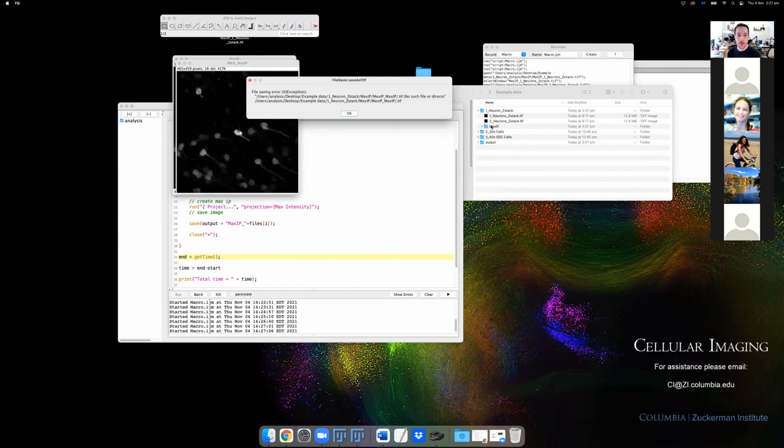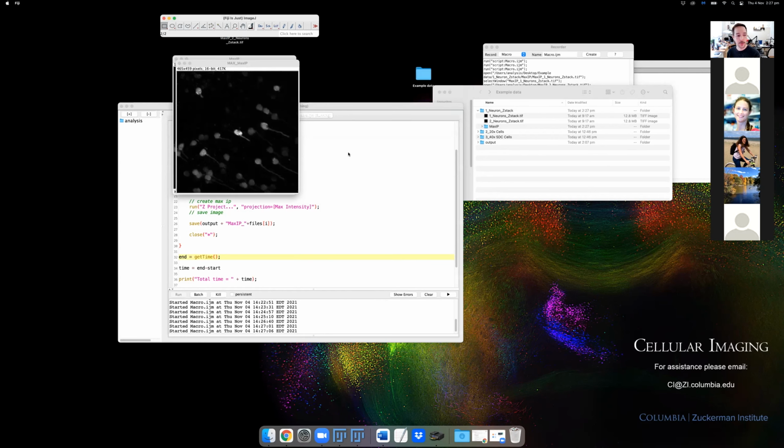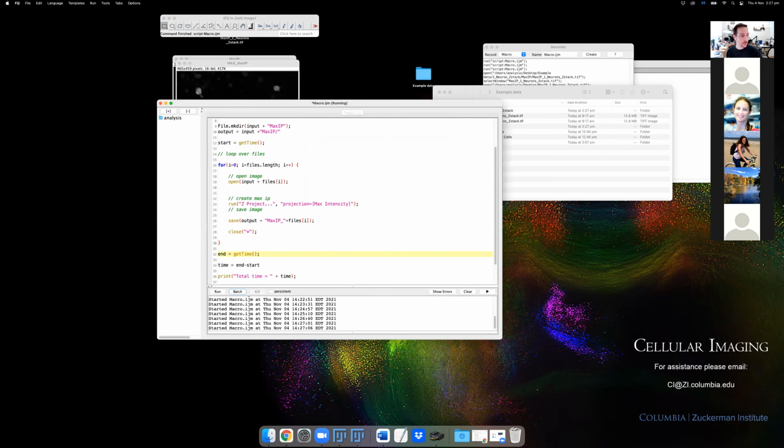And so a really useful thing that we can do is just process only images. And this way, if you've got text files or folders or other things inside the folder and you don't want to process those, we can ignore those. And probably the best way that I can help you with this is I'll just share a function with you that deals with this. Maybe I'll put this in the chat.